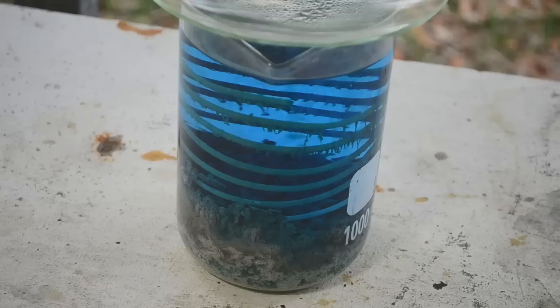I'll probably start off with hot water washes to just get the blue copper nitrate out of it. And then once I don't see any more color in it, then we can move on to more thorough, possibly, cleaning with acid. So let me get started.